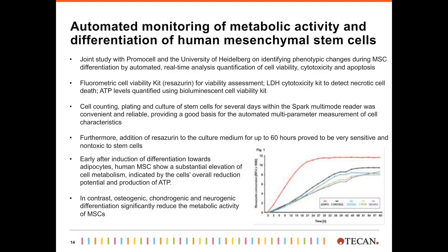We then monitored the differentiation over 60 hours and measured viability, and here we found that resazurin was non-toxic to stem cells, but a very sensitive approach. Early after induction of the differentiation towards adipocytes, we found a significant elevation of metabolism and ATP content. In contrast, the osteogenic, the chondrogenic, and the neurogenic differentiation significantly reduced the metabolic activity of MSCs.